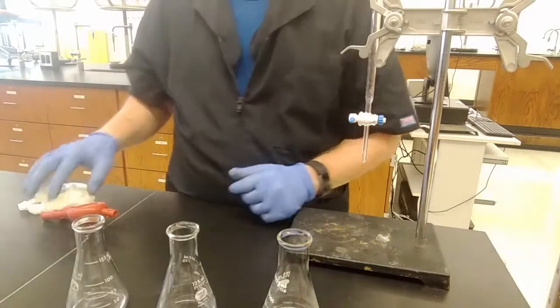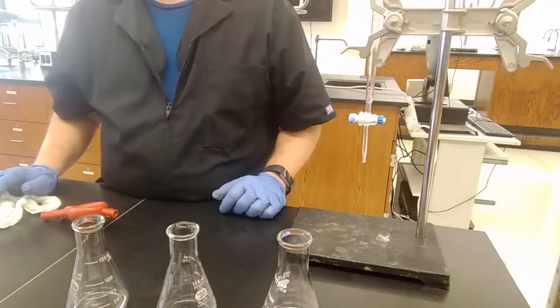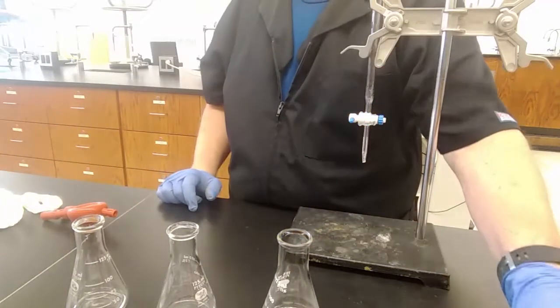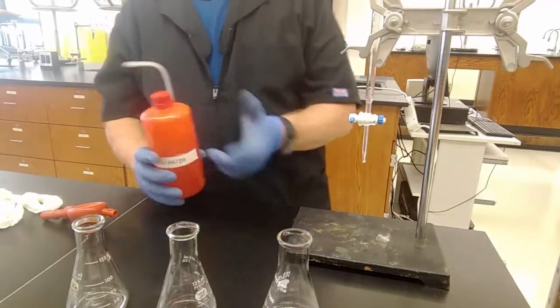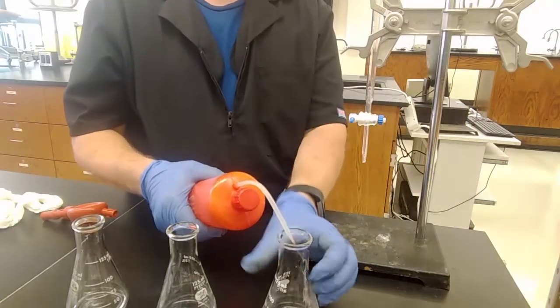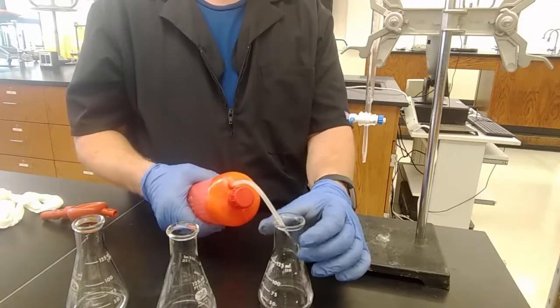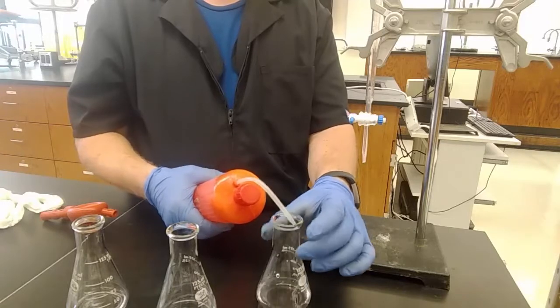So we have three flasks. The next step, we're going to add about 10 milliliters of deionized water to each of the flasks. How come? Because we want to just have a decent volume in there, and 10 milliliters can be a little bit challenging. So I can use my deionized water bottle to rinse down the sides of my flask.